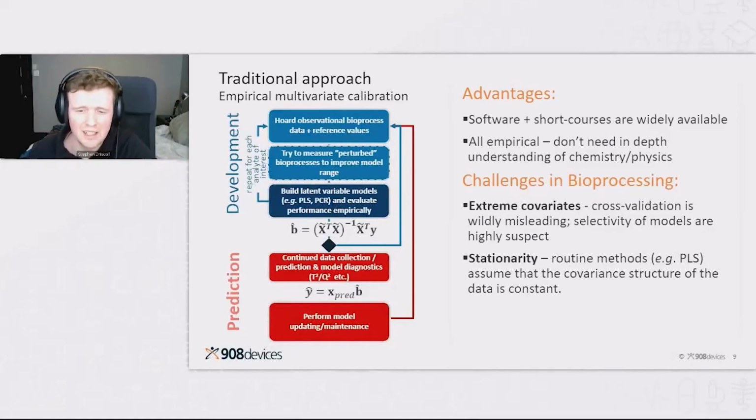I'd just like to mention that all of these drawbacks are a symptom of a mismatch between the modeling framework and the application that you're applying it to. The first one here is that bioprocesses by definition are extremely correlated. You have a system that's pretty much totally contained and things are extremely correlated with one another. That's analyte concentrations, the error model of the total system. Where this comes into play is when you need to be very, very careful when you're doing cross-validation for these types of data sets, because you may be tricked into thinking you can predict something that you're actually not predicting.